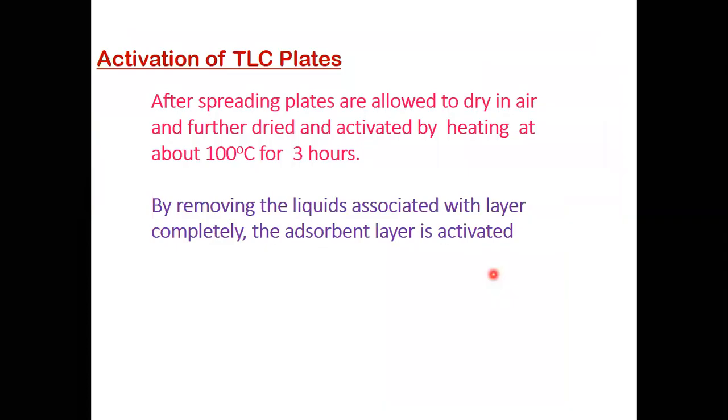Next step is the activation. After coating, dry these plates at room temperature, and after drying at room temperature, place them in hot air oven at 105 degrees centigrade for 3 hours to activate them.